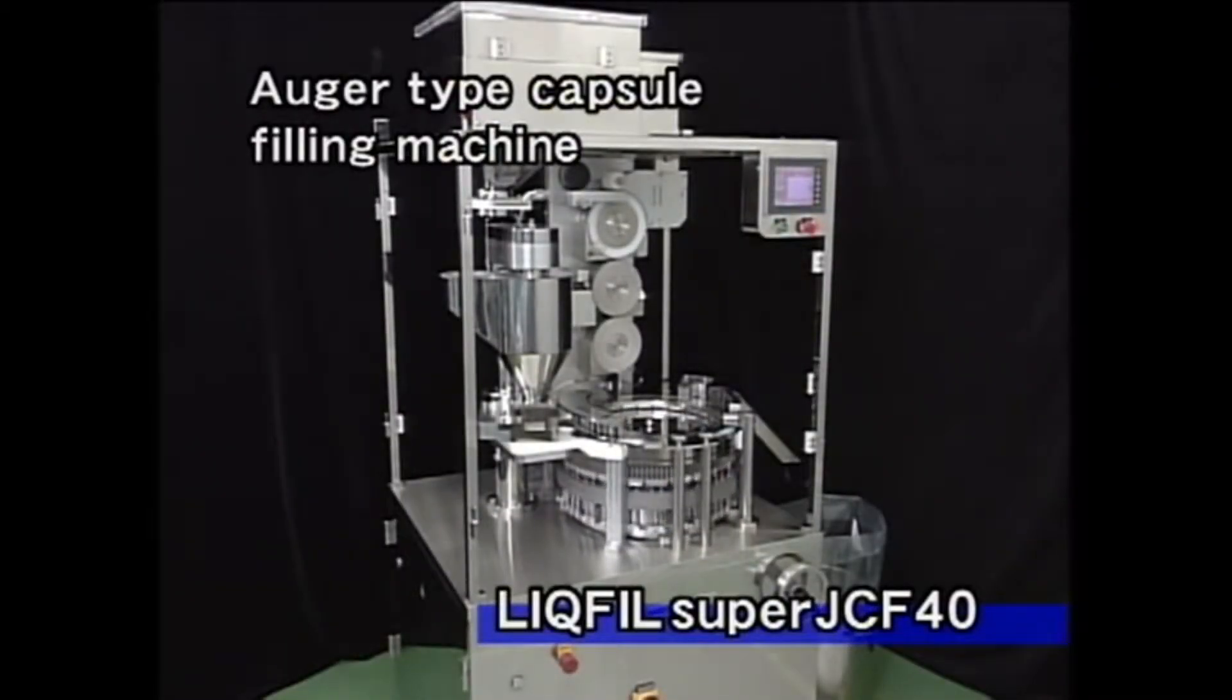The JCF40 is an auger type filler that can handle any kind of powder without being influenced by its characteristics.